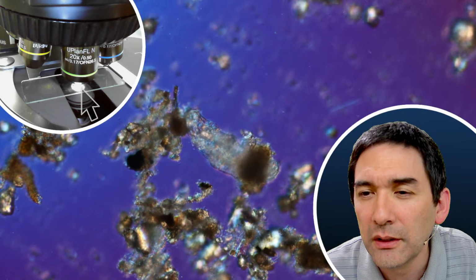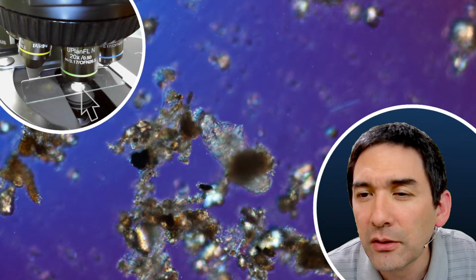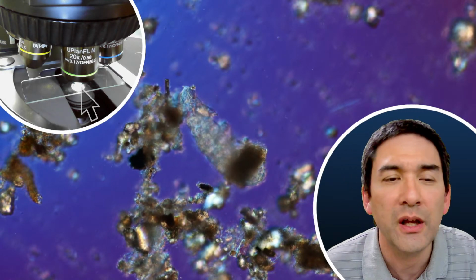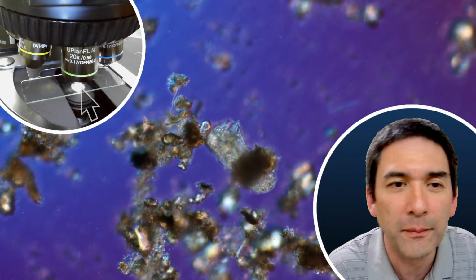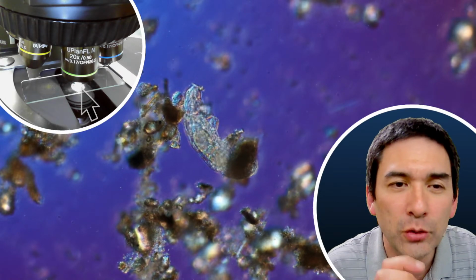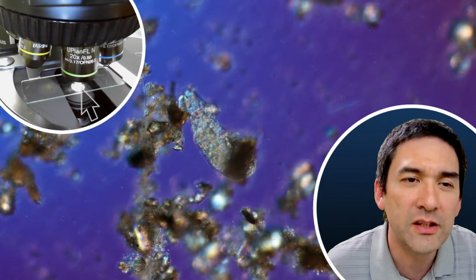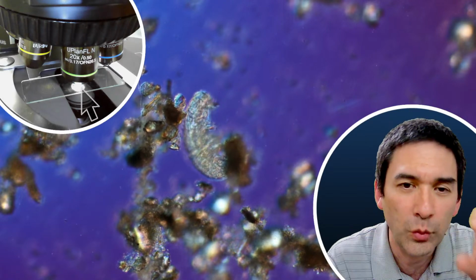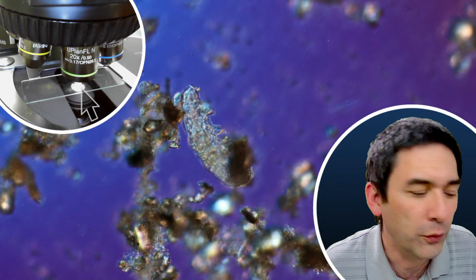So let's have a look here. Lots of conversation going on. Is the tardigrade eating something, or is something else trying to eat it? It's difficult to see what's going on. Let's put it this way: the tardigrade is probably always eating something if it finds bacteria or so, but it's trying to crawl ahead and it's not able to move forward because there is nothing to cling to. It's kind of like walking in air, or walking in water. Because everything is so smooth, it's not able to move forward.